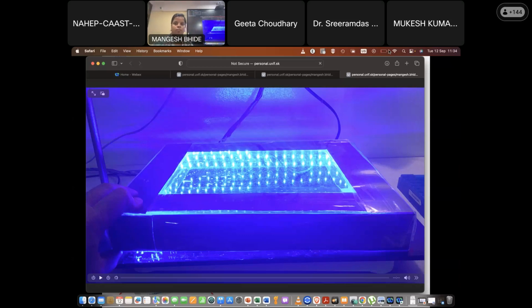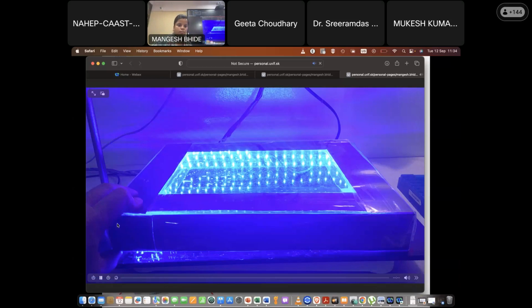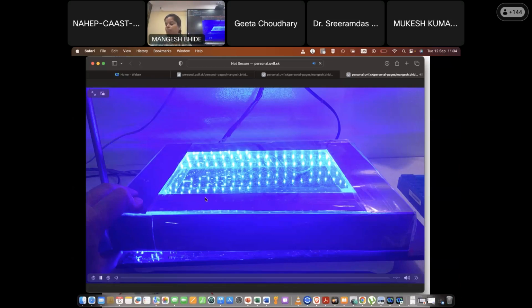If we have normal light, it has a mix of all wavelengths, and we need a cube to separate those wavelengths. But if you purchase LED light strips, each color has its own wavelength. If you purchase the blue, it is 488 or 480, and that is not harmful for DNA at all.